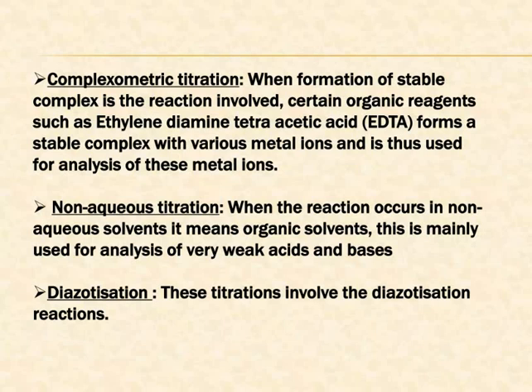Now complexometric titration. When the formation of a stable complex is the reaction involved, certain organic reagents such as ethylenediaminetetraacetic acid, which we call EDTA, form a stable complex with various metal ions and are thus used for analysis of these metal ions. My friend, we have to know the non-aqueous titrations. What are non-aqueous titrations? When the reaction occurs in a non-aqueous solvent, meaning an organic solvent, and this is mainly used for analysis of very weak acids and bases.